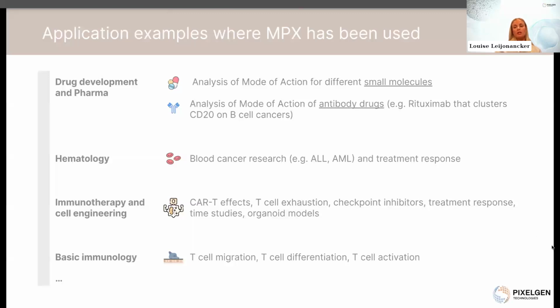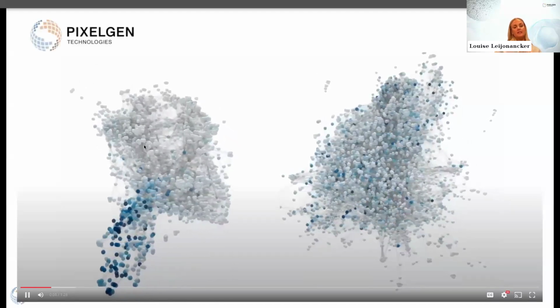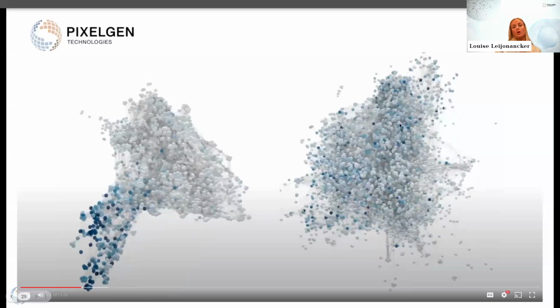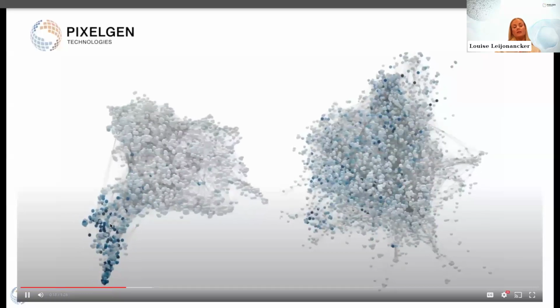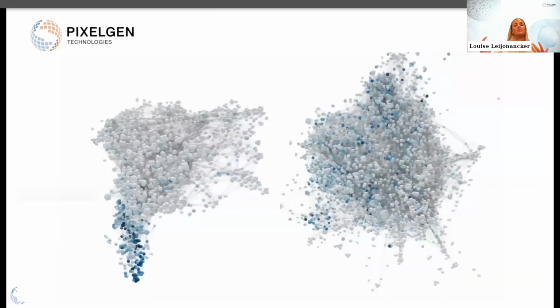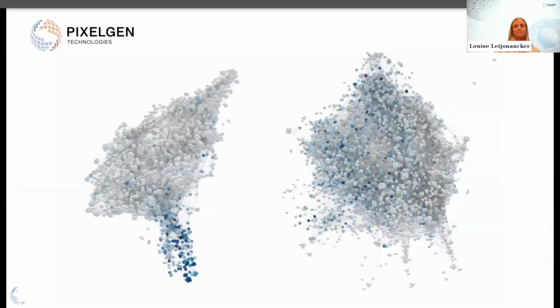So a lot of different applications. And I would like to show you, we didn't have time to look at that use case today, but here you have what I mentioned in the beginning: a T cell that's getting ready to migrate into a packed tumor environment, compared to a control cell. And here it's been colored in blue for the markers that are polarizing when this migration event occurs. So this is the kind of 3D visualization that I have been mentioning that is possible to generate with molecular pixelation data.